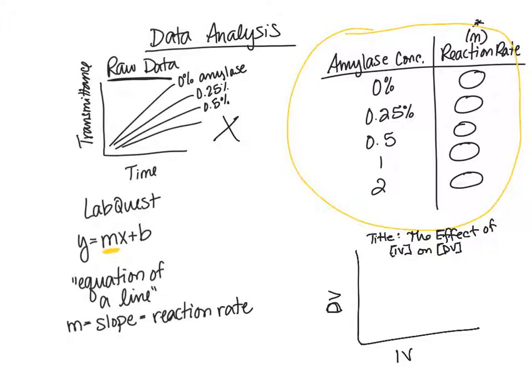And you're going to end up with a single line. All right, so remember you are graphing your analyzed data. You are not graphing your raw data.